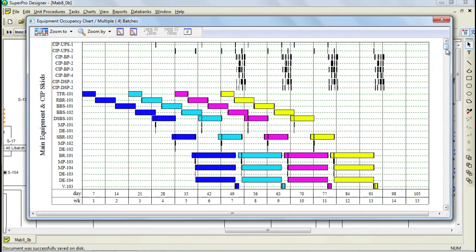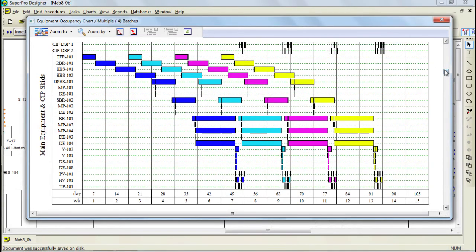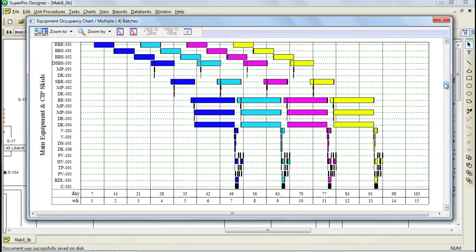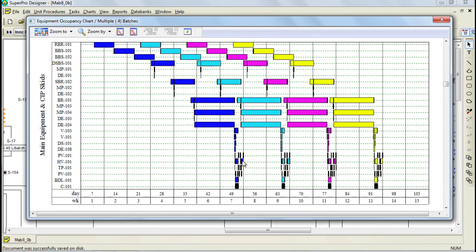In the top area of this chart, you see the CIP Skid Occupancy and below that you see the rest of the equipment in the process. This chart is very useful in identifying bottleneck equipment. It can also be used to analyze the impact of multiple equipment items that carry out the same operation but operate out of phase. In the chart, the different colors represent the different batches and when you see an equipment with multiple rectangles on the same line, such as this one, it means that a piece of equipment is used multiple times in the process.